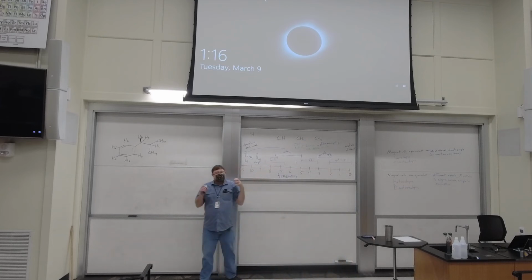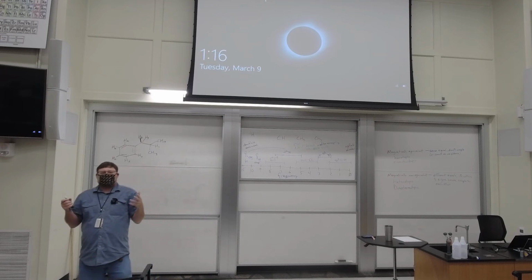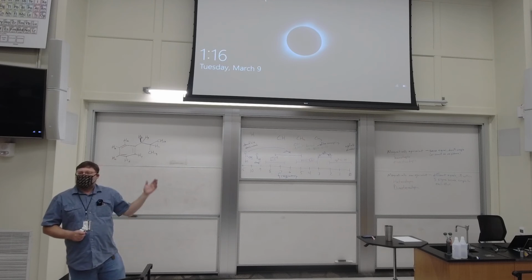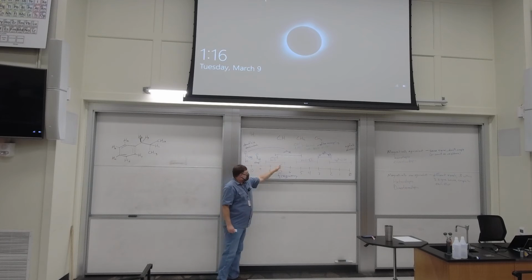The reason I say not to memorize numbers is, I don't know why textbooks do this. They feel like they have to give you numbers, and people like numbers. That is 114.2, even though you can't measure it that accurately, right? So I've given you ranges here. You can just sort of memorize the order they come. If you like numbers better, memorize the numbers.